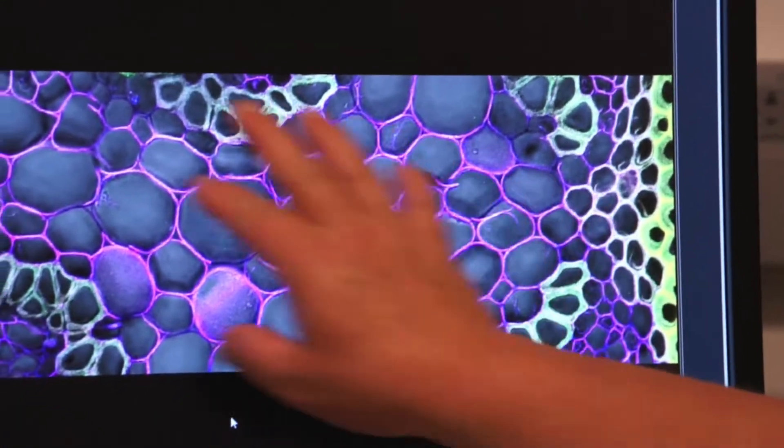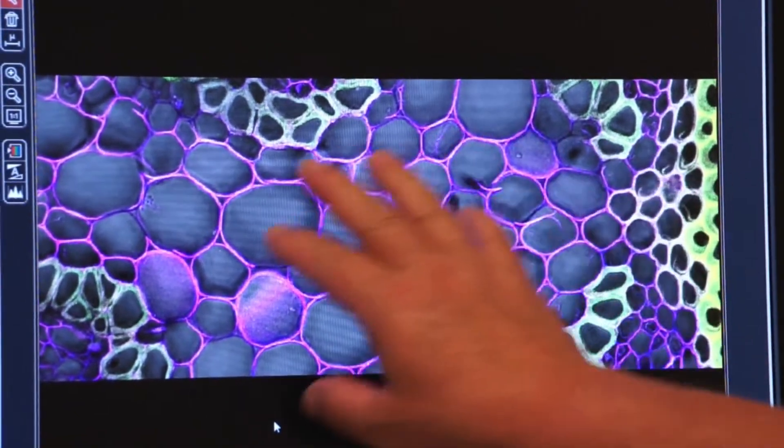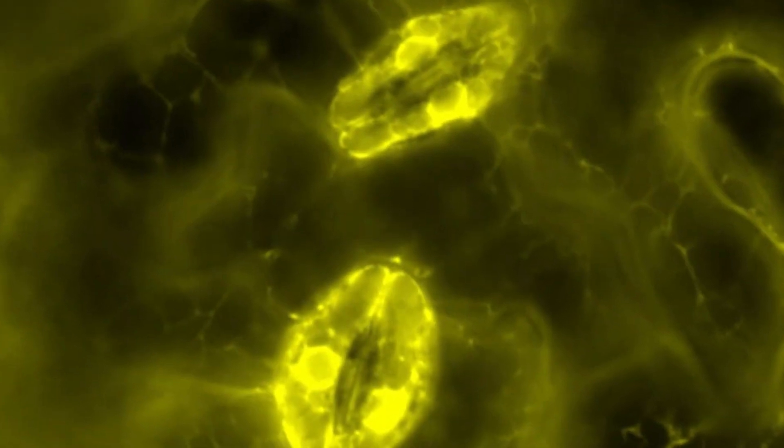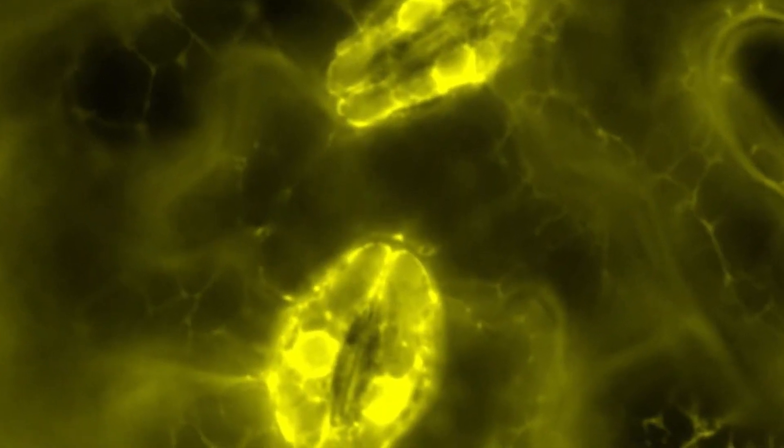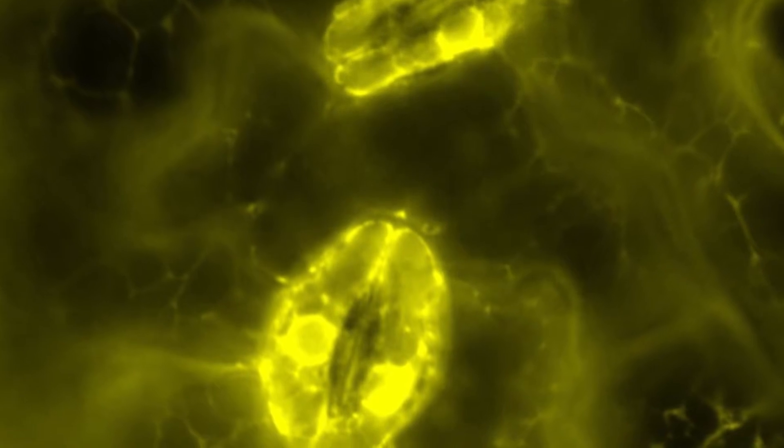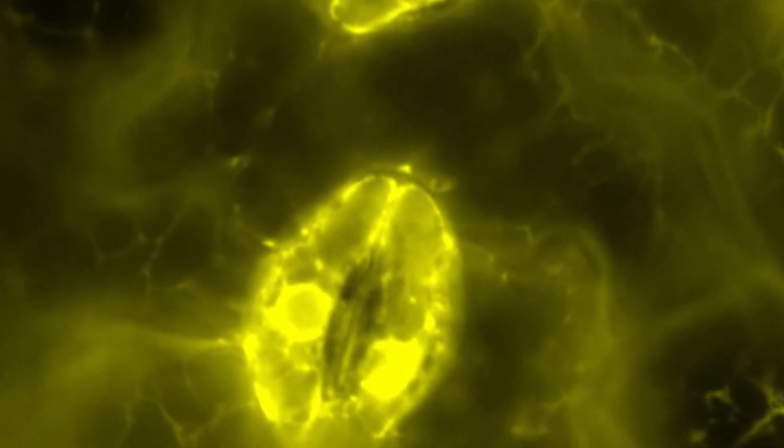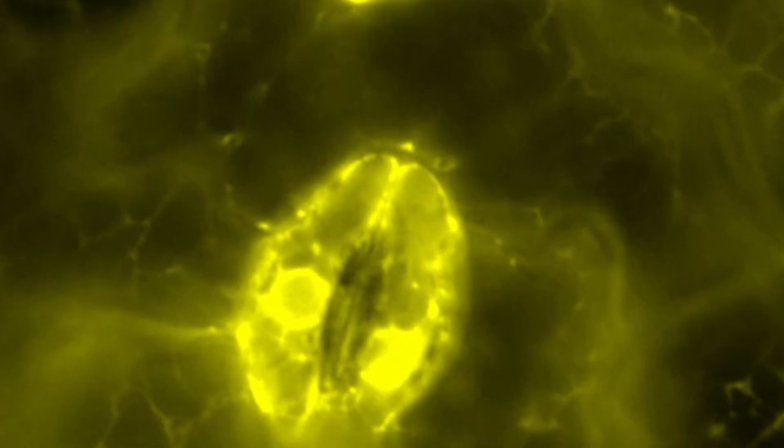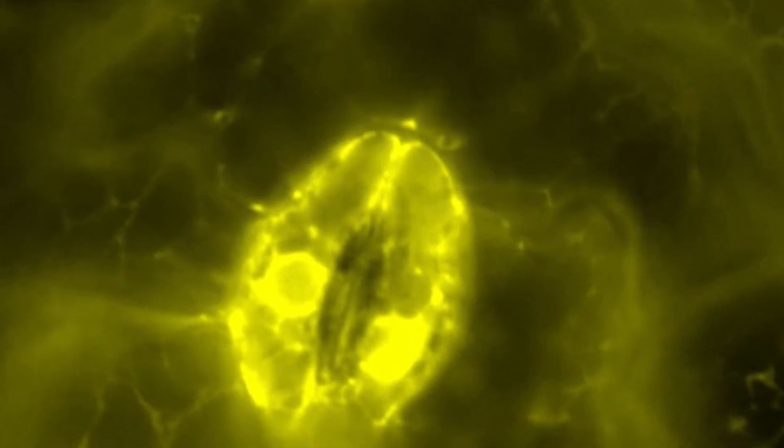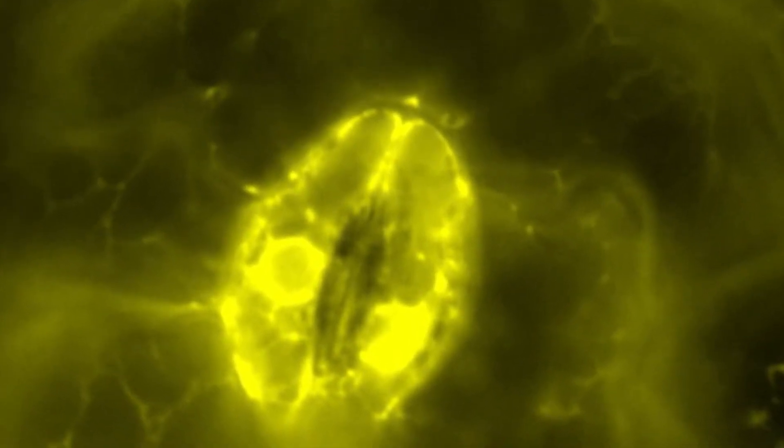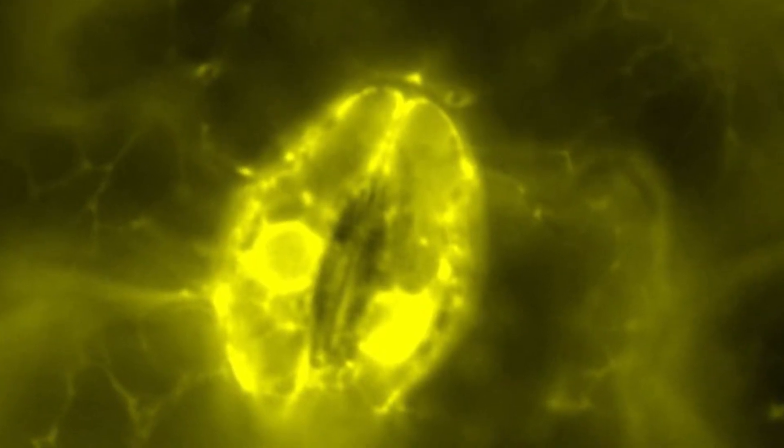Now for the end of this chapter, we have more images from Rigoberto Ramirez and Ernie Kwok. This is one of the guard cells of Arabidopsis thaliana. The endoplasmic reticulum is labeled with yellow fluorescent protein. It shows that the endoplasmic reticulum is localized around the nuclei.